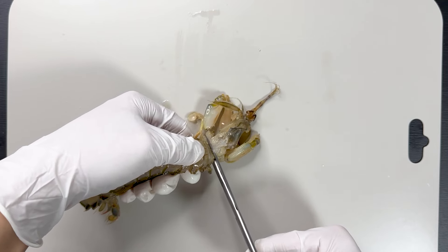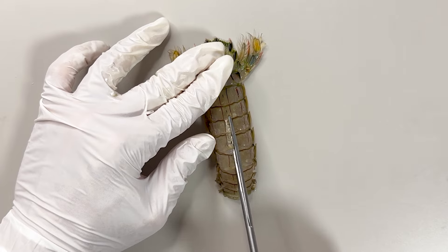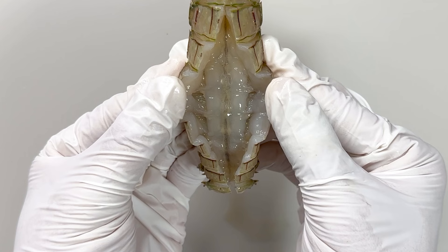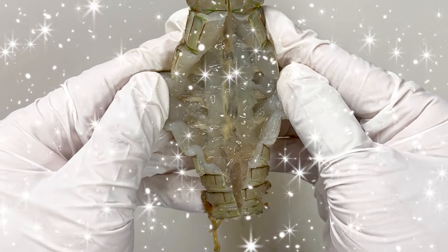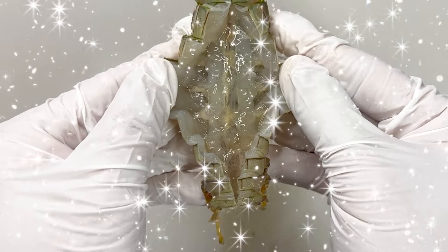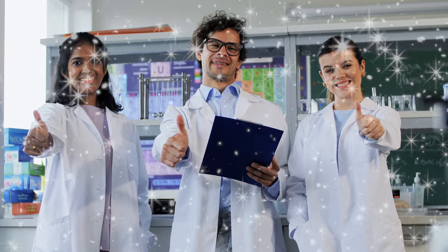After removing the cephalothorax and leaving only the abdomen, we cut open the carapace. This slightly darker area is the digestive tract of the mantis shrimp. Like shrimp, the mantis shrimp has a digestive tract running along the back, and a nerve tube along the front. You can see the white tissue around the digestive tract — this is the reproductive organ of the mantis shrimp.